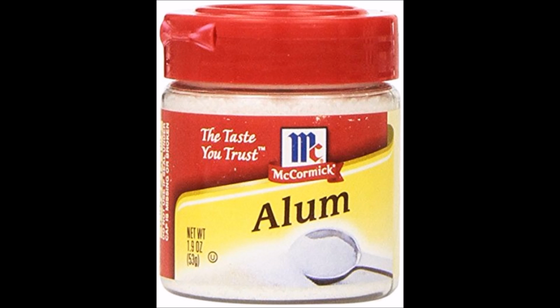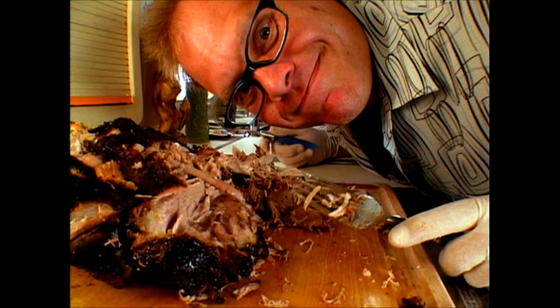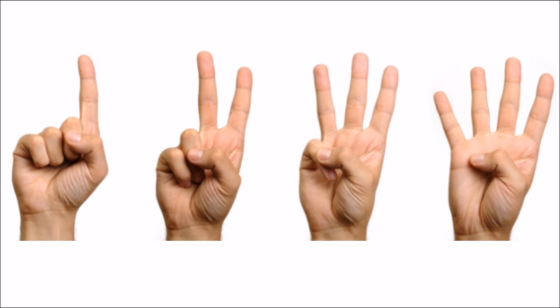The objective of this lab was to investigate the process of crystal formation. Specifically, we analyzed the formation of alum crystals. Alum is used in pickling pickles and apparently making pulled pork very crispy, as well as other uses. We achieved our alum crystals through a series of steps.